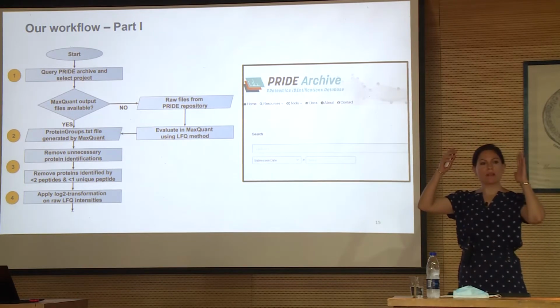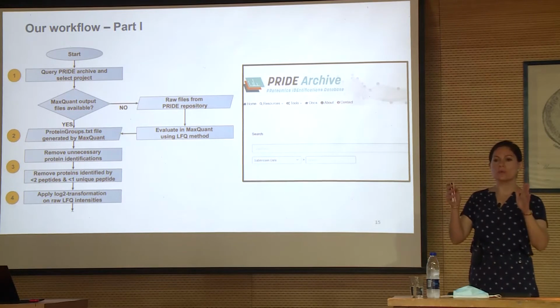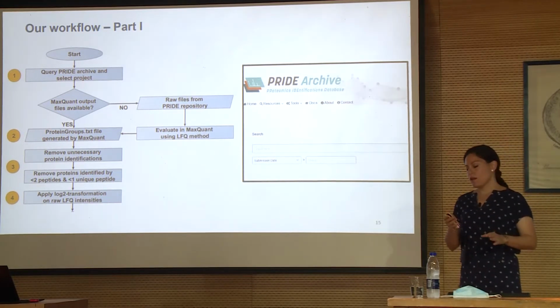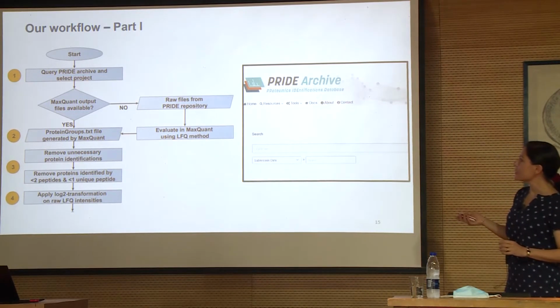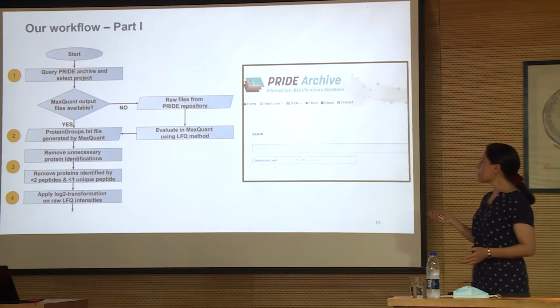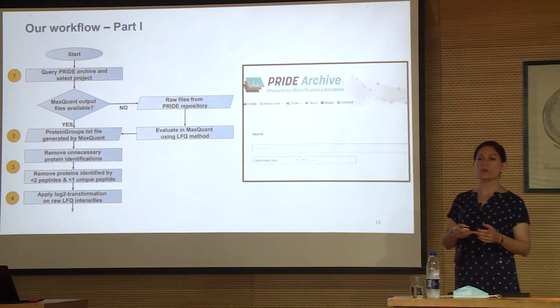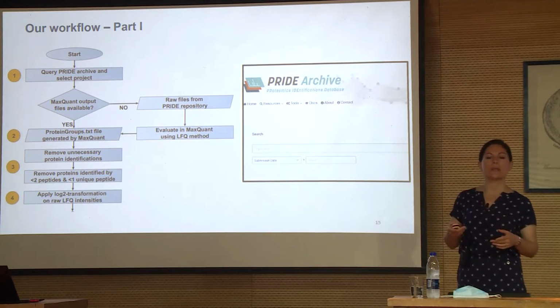But the workflow runs automatically, and you have your protein groups, that's the file that you need, and it will give you the output automatically with some little help from you. But yeah, we start here with the search in PRIDE. The search is okay, but if you want to have some term to exclude, or if you want to look for simultaneous keywords, sometimes it gets complicated.